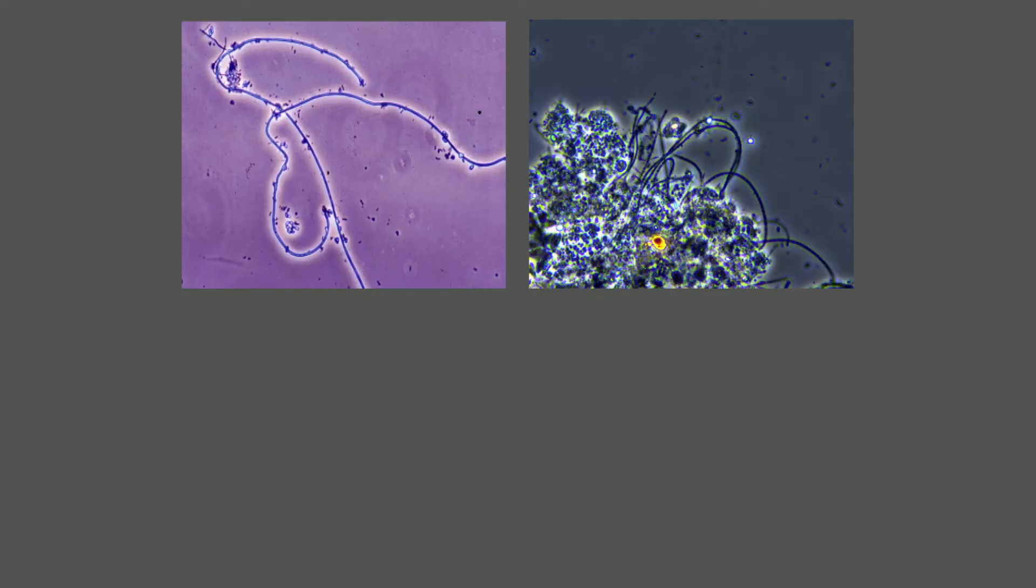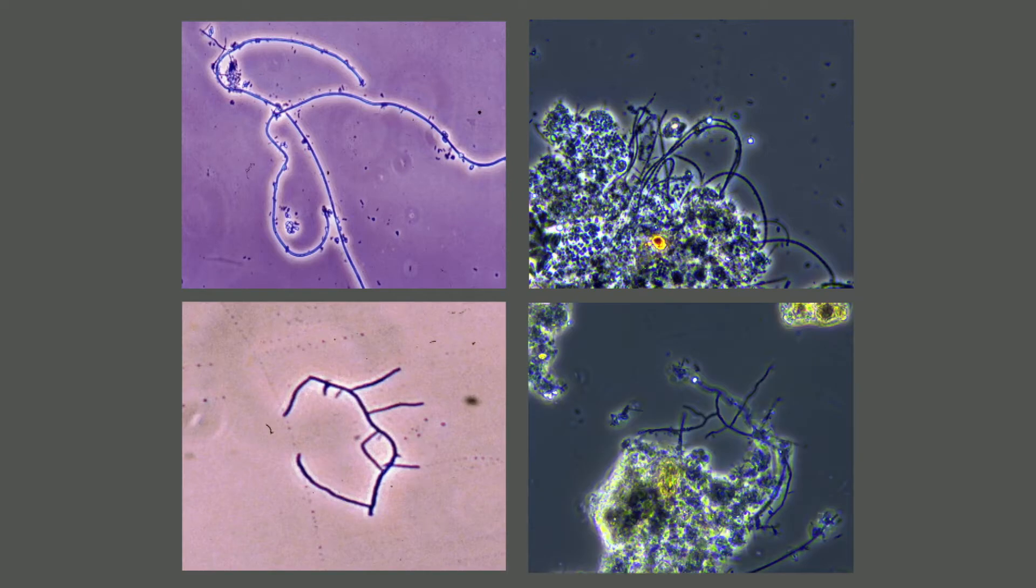Now in domestic wastewater treatment plants, the most common and challenging filaments we encounter are Microthrix parvicella, which resembles spaghetti, and Nocardia forms, which are the only true branched filament.